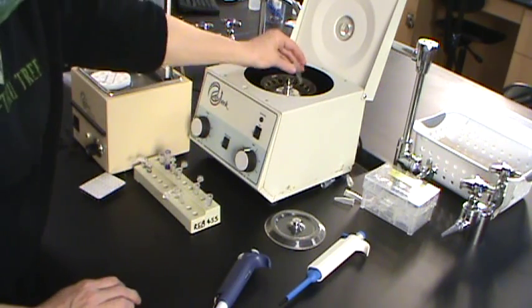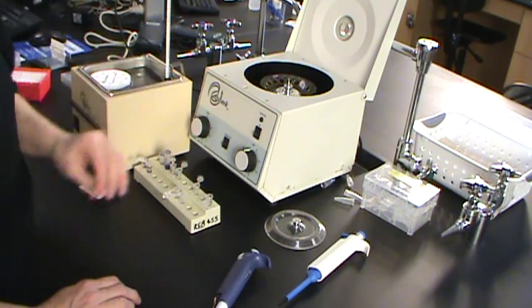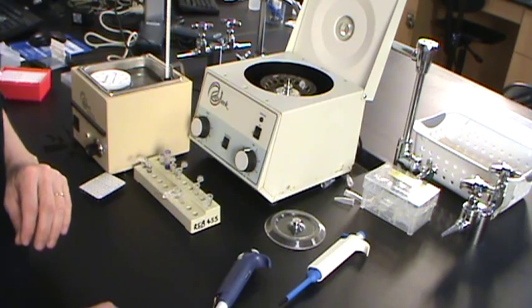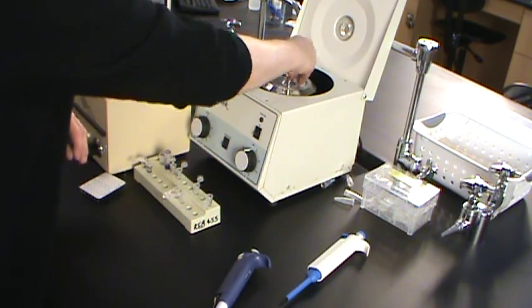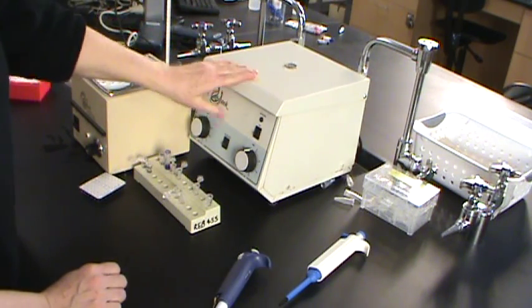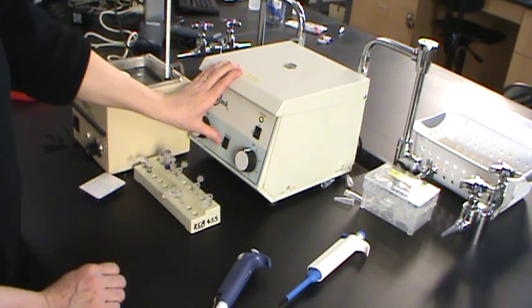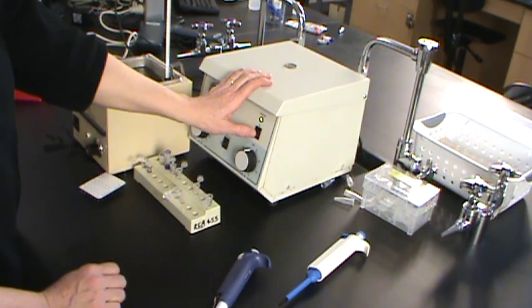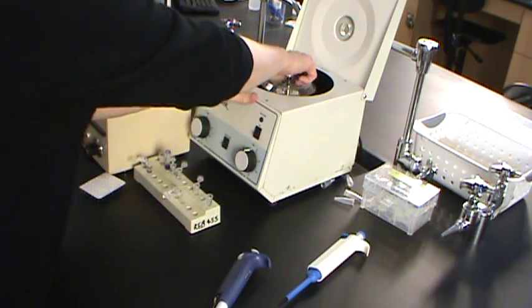Again, as with all centrifuges, we're going to have to put those tubes across from each other to balance them. This centrifuge at high speed will go about 14,000 rotations per minute, and so we really need to make sure that those are balanced. We have a lid that goes on that. Close the lid, and just a momentary centrifugation will bring all of that solution down to the bottom of the tube. And then we're ready to do our incubations.